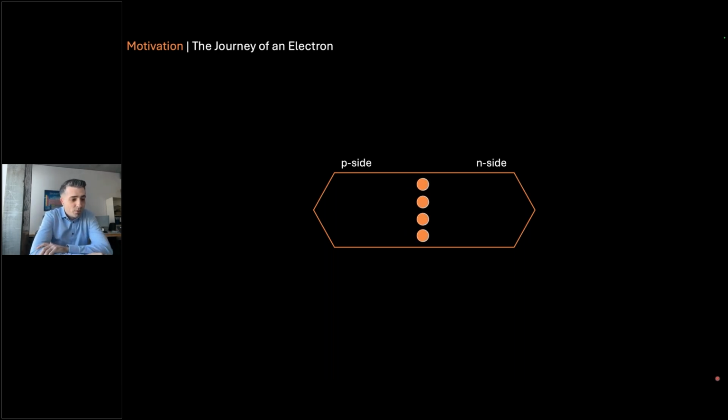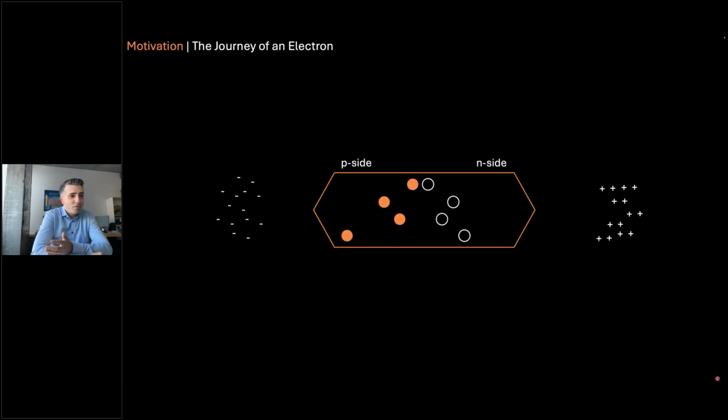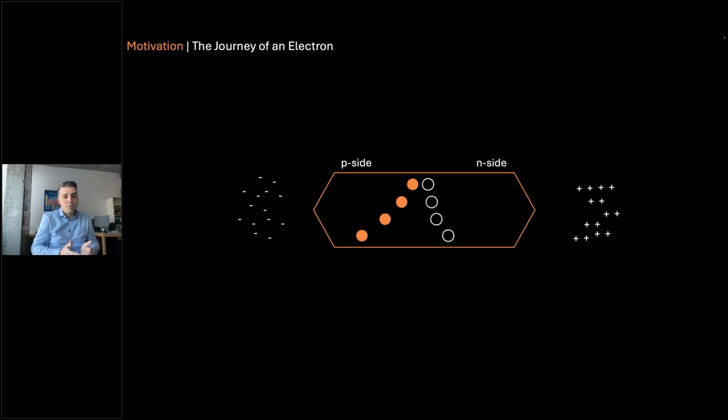And by applying an electrical bias from outside, we can change or redistribute the charge carriers within these regions or interfaces. By this, we can turn tiny devices on and off, for instance. And for me, doing dynamic investigations, always the question was, what is happening in between? I mean, we can use a biasing holder and switch states, but what's happening in between? Is the transition from one state to the other state some kind of random interaction of the charge carriers, or is it following some kind of rules? So this is the question.